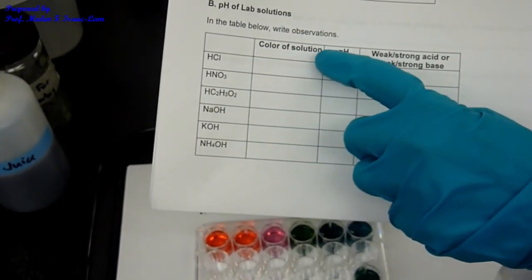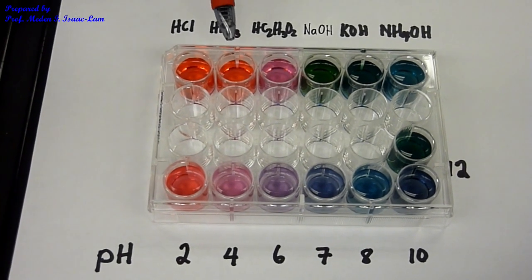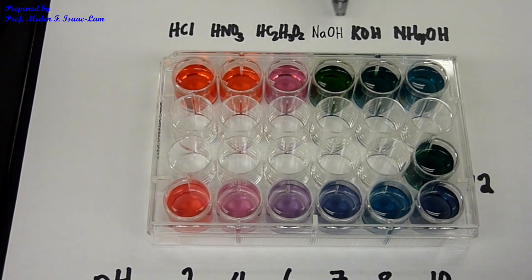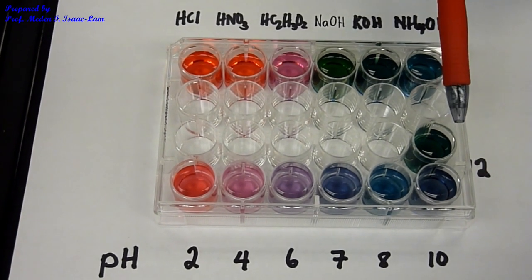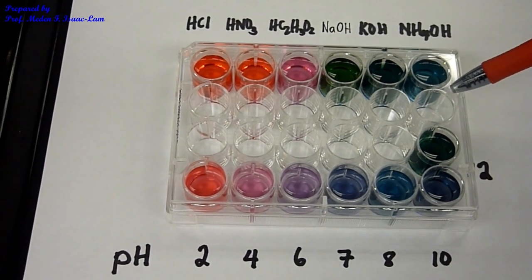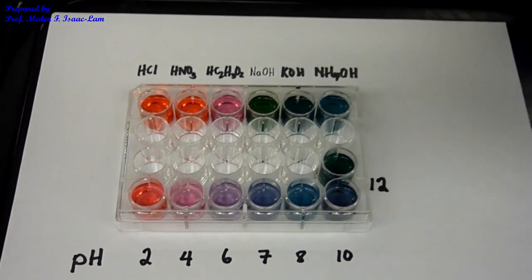So now we're identifying the color of the solution, and this one is going to be the pH. Hydrochloric acid and nitric acid are the same color, while acetic acid is this color. Sodium hydroxide and potassium hydroxide are the same color as this solution in here. It's pH 12. However, this one is slightly less green, so let's say it's closer to this. So that's now the result from part B.